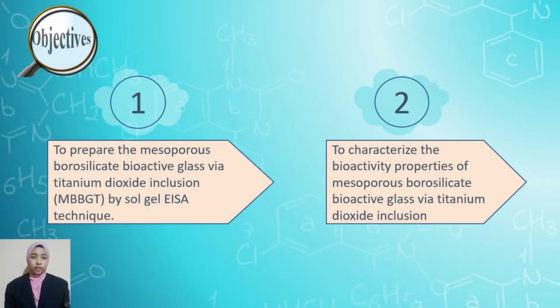The objective of this project was to prepare the mesoporous bioactive glass via titanium dioxide inclusion by sol-gel with the EISA technique. Second, to characterize the bioactivity properties of mesoporous borosilicate bioactive glass via titanium dioxide inclusion.